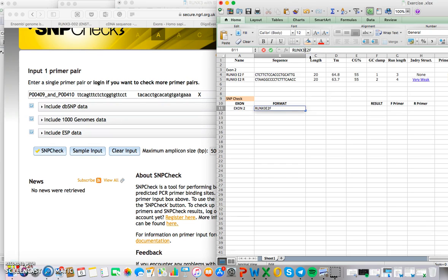We're going to put it together. And this one. Paste. And together. Okay, this is our format. This is our forward. This is our reverse.